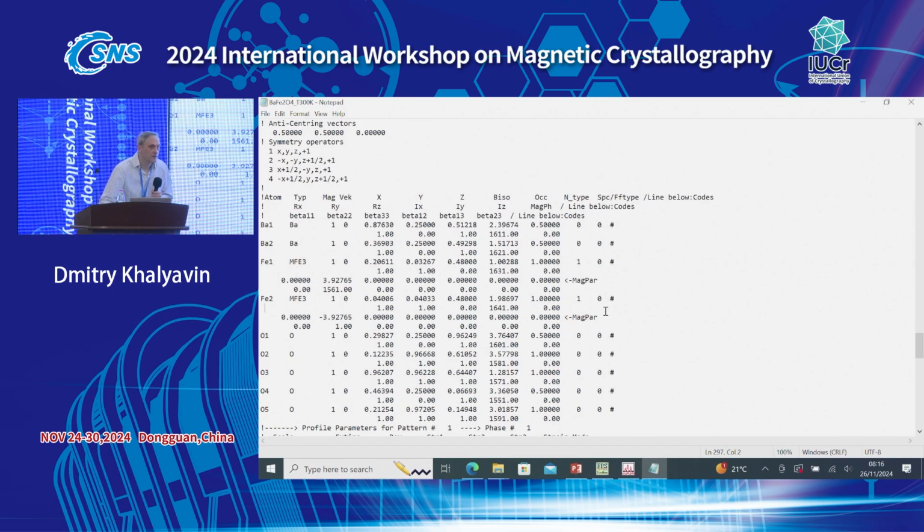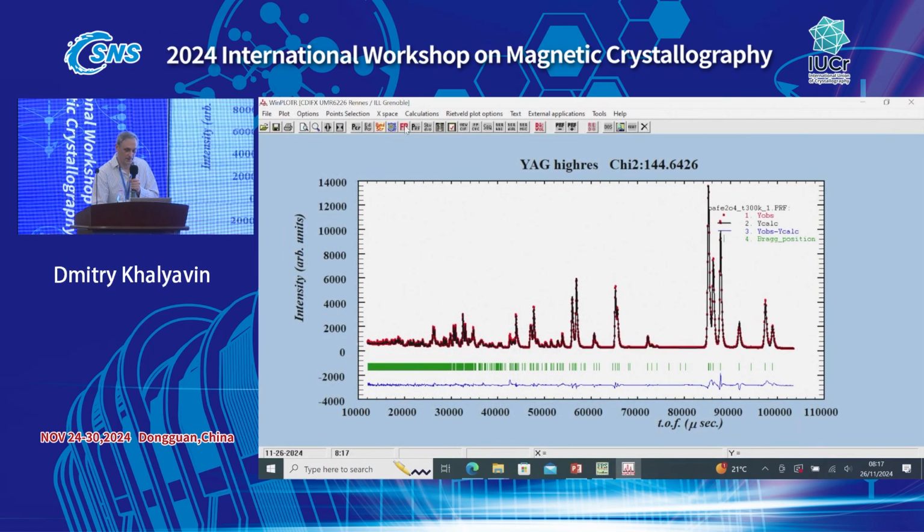Sorry, say again. Nothing, it will fix to 0. Yeah, we can do it. The program is smart enough. It will fix it. No, you see, for instance, 0.25. This component is fixed by a special Wyckoff position. So let's tell the program we want to refine, and let's see what it will do. I think it will fix it.